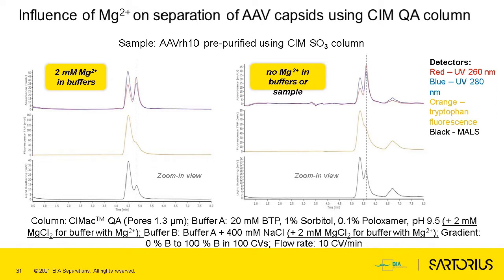quantify several peaks, but it is definitely good for the prep, for purification, because this part of empties are nicer removed, or there is better resolution between the full and these empties, which I look at later on, than when we use magnesium, because the empties and full are really closely together.